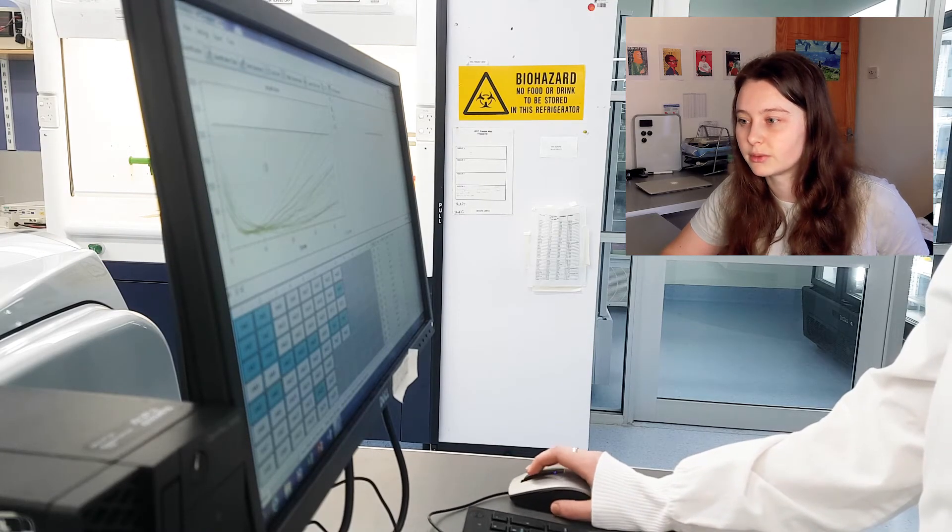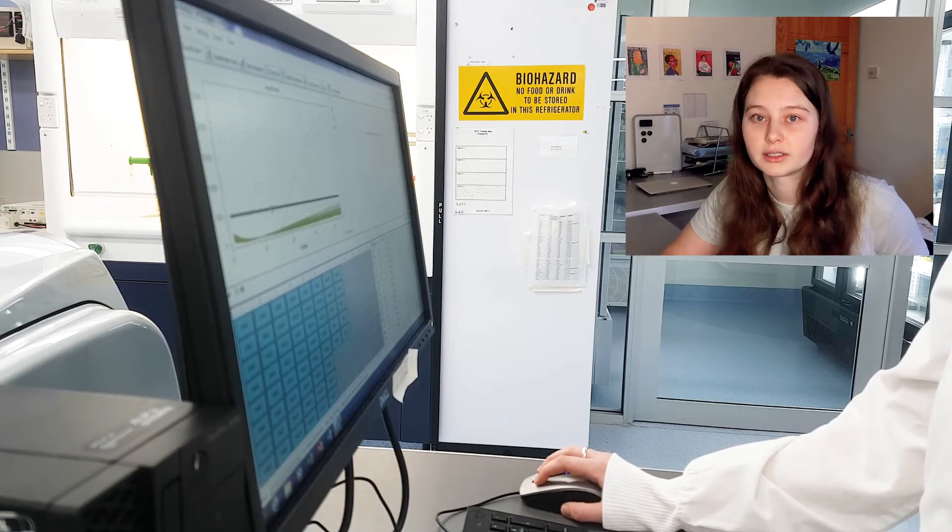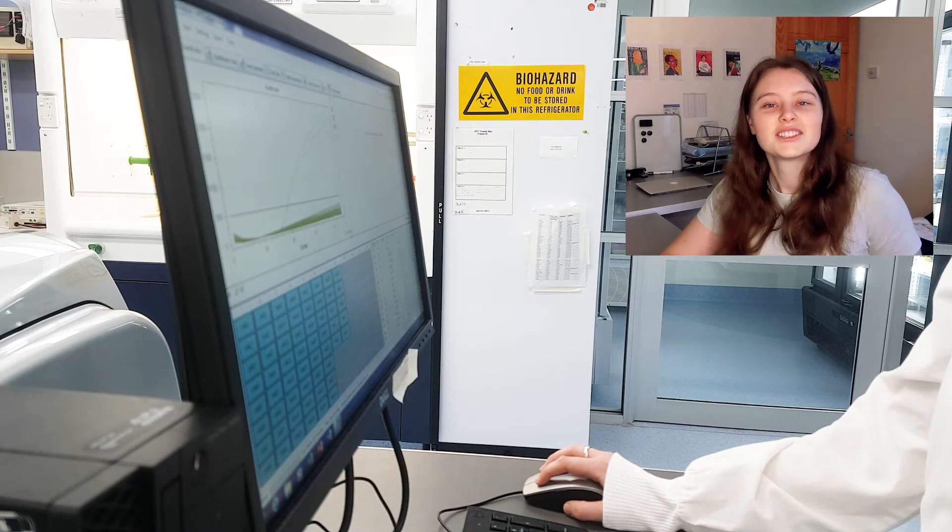I'm just switching between the two different fluorescences that I was looking at, because they indicate the two different infections I was looking for. Okay so that's it.